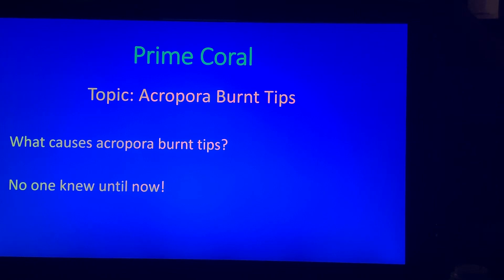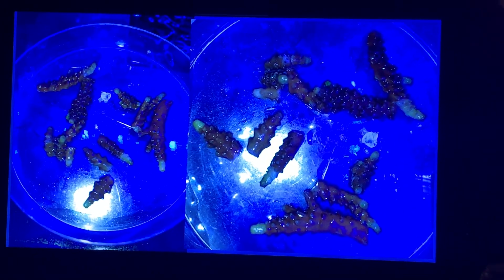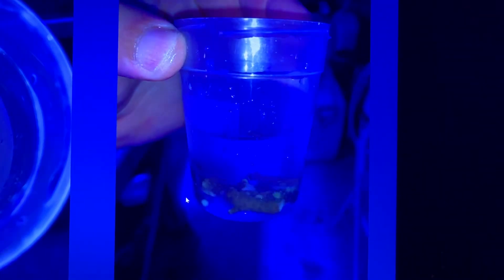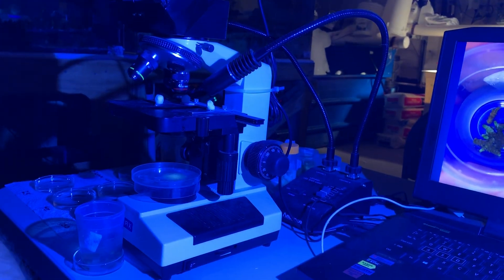For our experiment, we harvested the burnt tips off of an Acropora colony, and you can see from the photograph that these tips all have what we call the typical burnt ends. I took these tips and placed them into a cup and kept them overnight. I put them in about 40 milliliters of water, and today we are going to take a look and see if there is anything that could be an infectious cause for those tips.